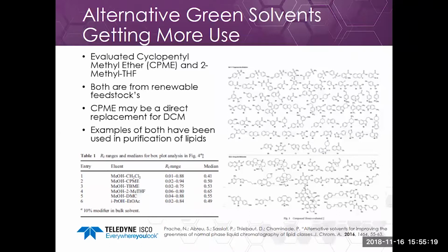Additionally, in another paper, which I didn't highlight here, but the reference is on the bottom, we're actually seeing the use of cyclopentyl methyl ether and 2-methyl THF predominantly in some purification of lipids. So you're starting to see that used in some alternative specialized chemistries, but you could start to apply that to more general areas too, especially once the cost of those solvents starts to drive down.